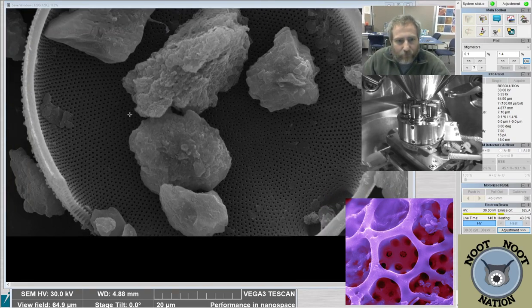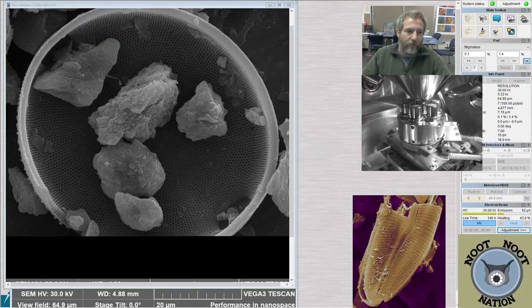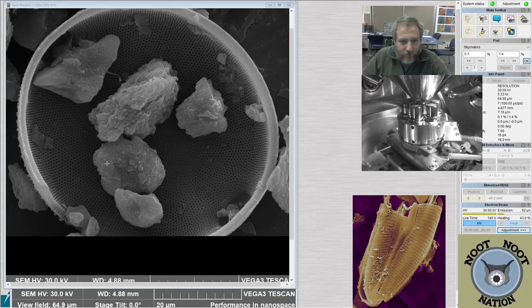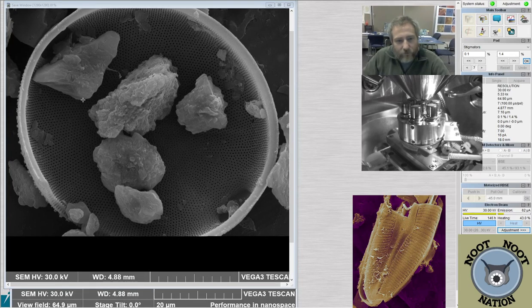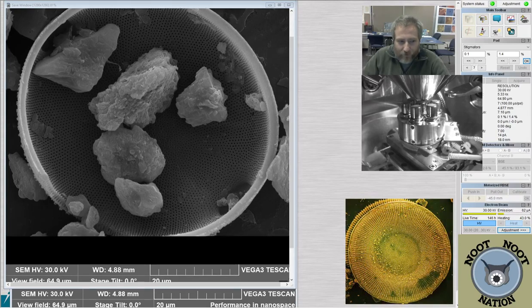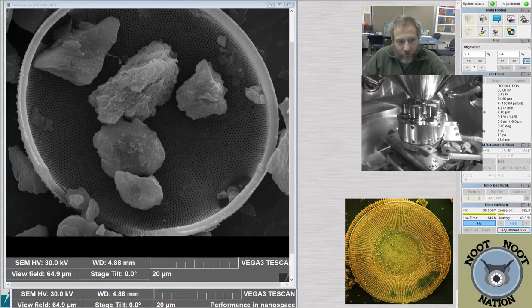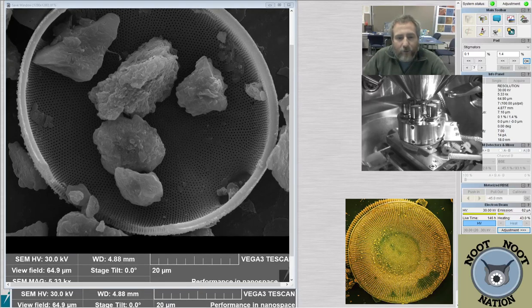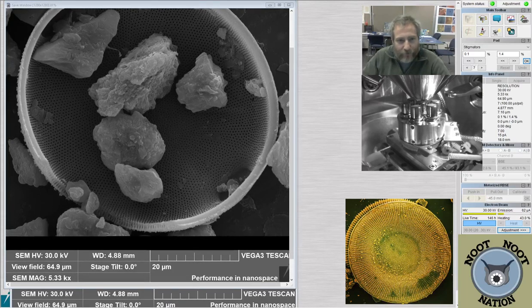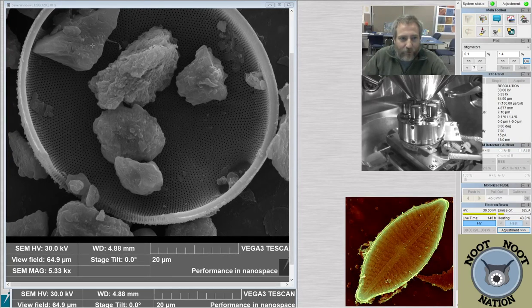Nice, highly resolved image, even though it's got some junk on it. Otherwise it would have been perfect, although this diatom's also broken a little bit right here. You see a chunk of it's been broken off, but otherwise would have been a really great specimen to image. It didn't have these boulders on it.